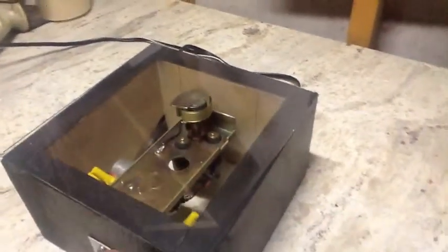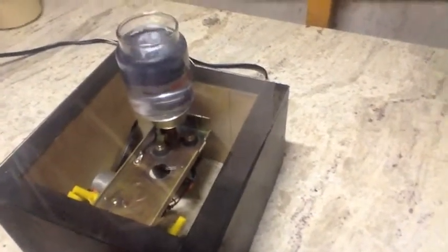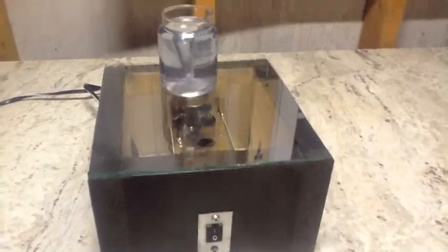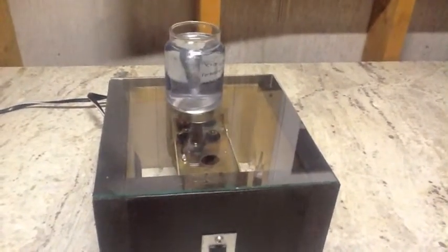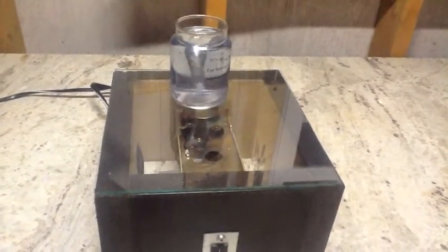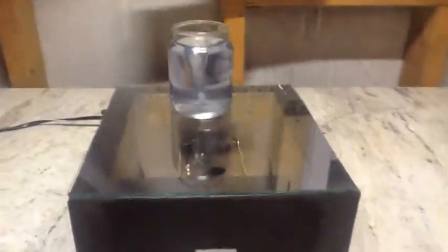Sorry about the shaky video — I'm trying to work and hold the camera at the same time. Let me make sure my bar is centered and let's turn the guy on. While it looks like it's a success, I'm actually going to call this a failure. And it's important to publish your failures too.